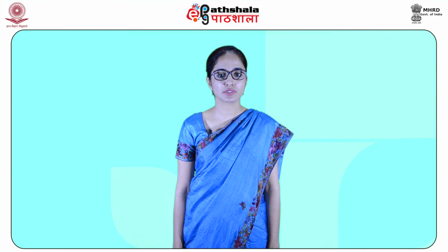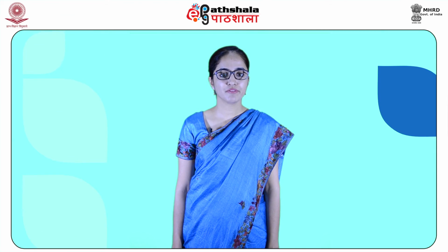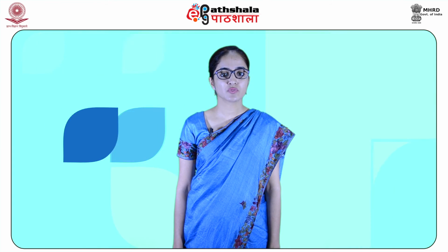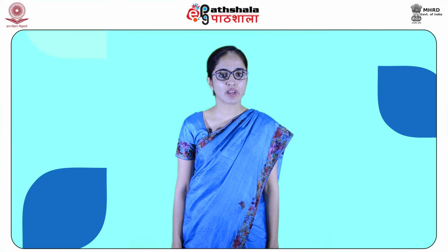Thus, the two components of a doublet will be so far apart from each other that it would normally not be accepted as a coupling. The two bond coupling, that is in triphenyl phosphine P-C-H, is comparatively smaller, having a coupling constant of 20 to 30 Hz, while the 3 bond coupling ranges from 5 to 10 Hz, and the 4 bond coupling is very small, with a coupling constant of less than 1 Hz, and is rarely observed.